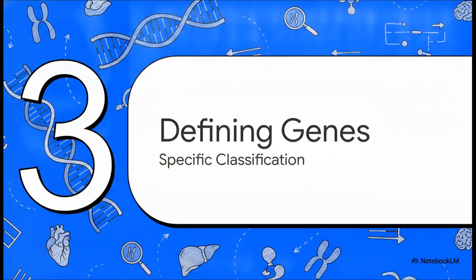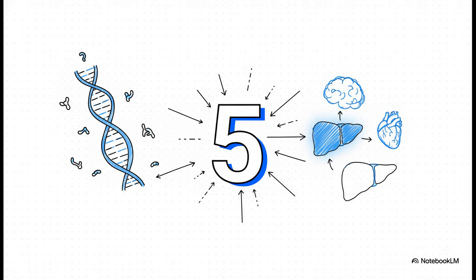Which brings us to Section 3, defining tissue-specific genes. Okay, the absolute crucial metric for the algorithm here is the number 5. For a gene to actually be classified as highly specific to a tissue, the algorithm dictates that it needs to have at least a 5-fold higher expression level in that particular tissue compared to all the others. So it's not enough for a gene to just be hanging around. It has to be overwhelmingly active. 5-fold is the magic number.